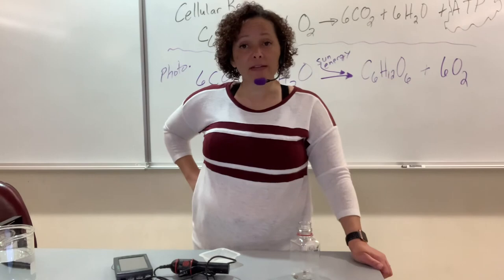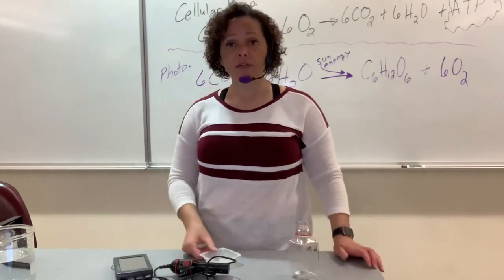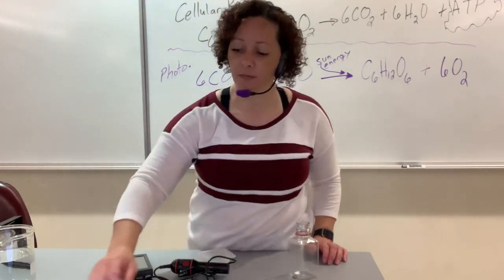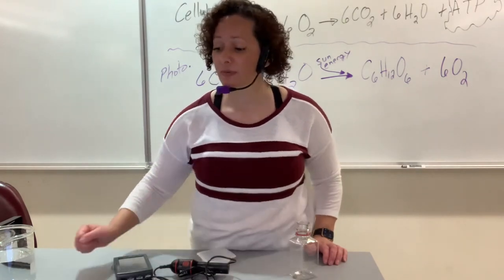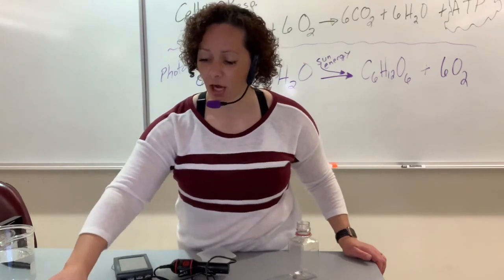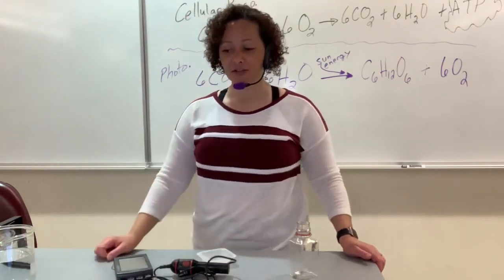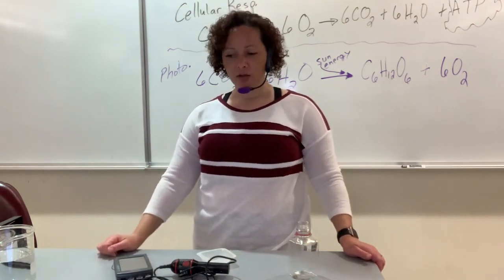The mass of the organisms. Remember initially I had you measure the mass of each of the organisms. So you will take that from your table 1, transfer that information there, the mass of those organisms. Then you will take the average slope, that last column from your table 2, and you will transfer it to that second column of table 3.